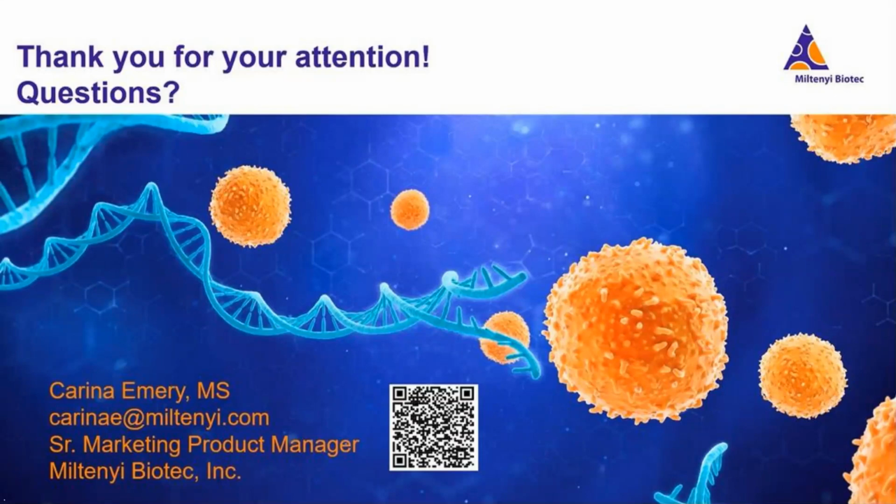Can we isolate nuclei from whole blood? From whole blood, I would recommend first removing the red blood cells. We do have a lot of products for working with whole blood. The first thing you want to do is lyse the red blood cells because that would obviously get in the way. After you lyse the red blood cells and you're left with either your PBMCs or your buffy coat, yes, it's super easy to isolate nuclei from your white blood cells.